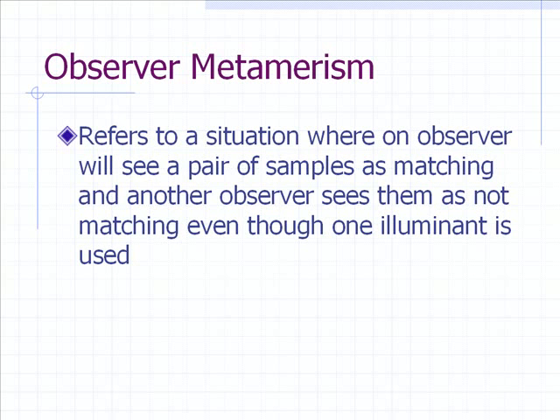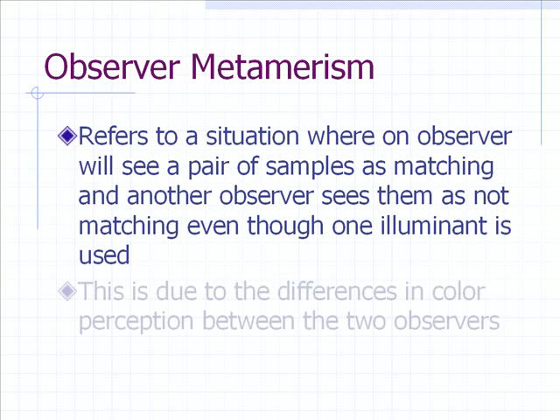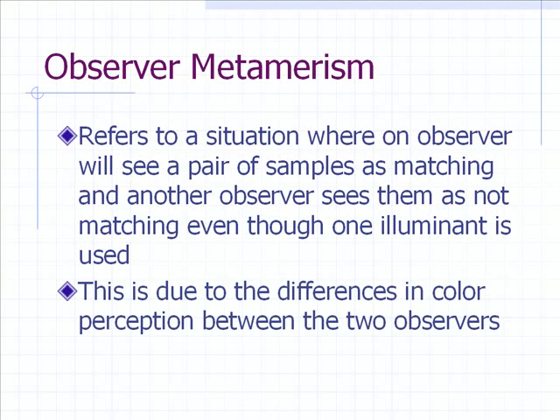And that can be a difference between two spectrophotometers. Maybe you have two different brands or even two different models or two different units of the same brand and model. They may read differently, just like people can read differently. They're getting a lot better at that, but it's still possible that there's a difference. Or there could be a problem with one of them.